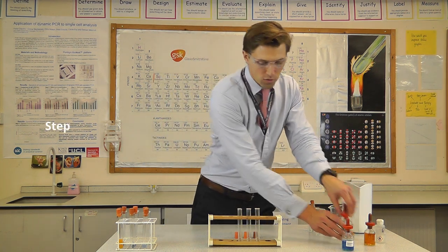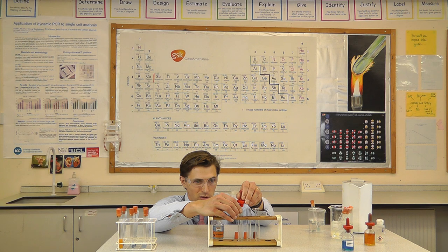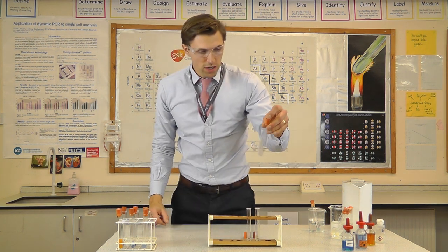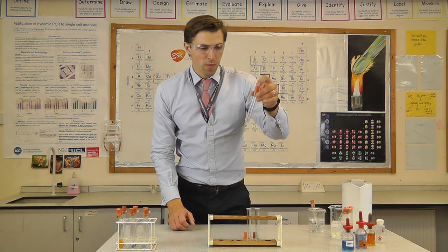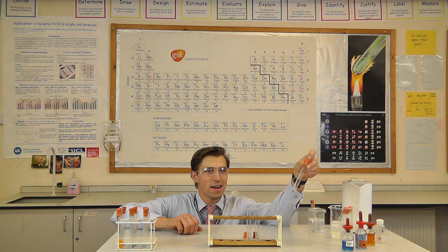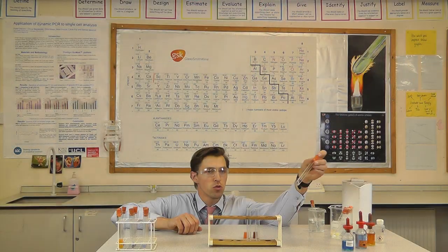Now we're testing for proteins using the Biuret solution. I'm not putting this one in a water bath — just adding five drops, then stoppering and shaking it. The solution started off as a pale blue. If there were proteins present it would turn lilac or pale purple. At the moment it's showing no proteins within this biscuit, which is what we expect.